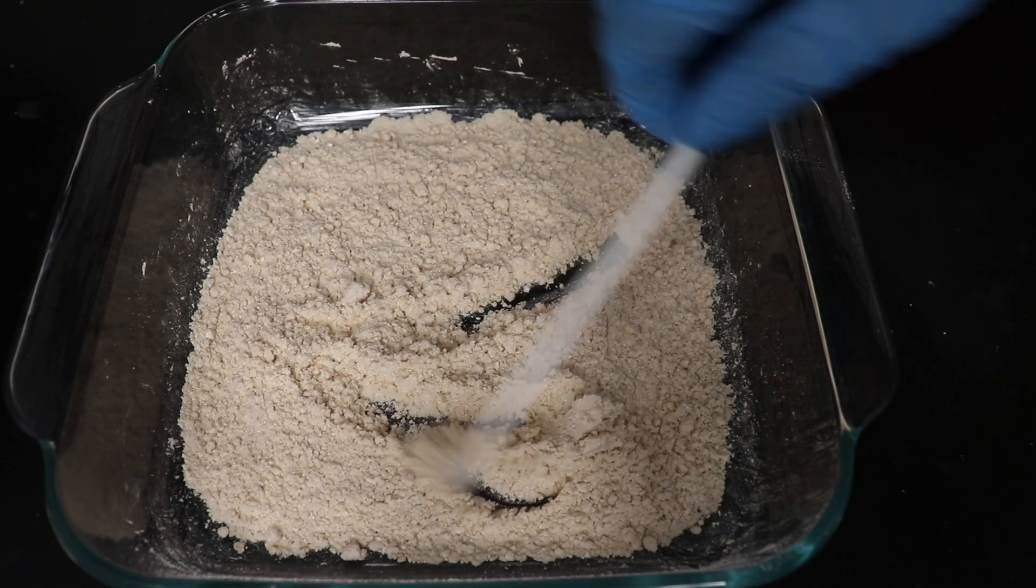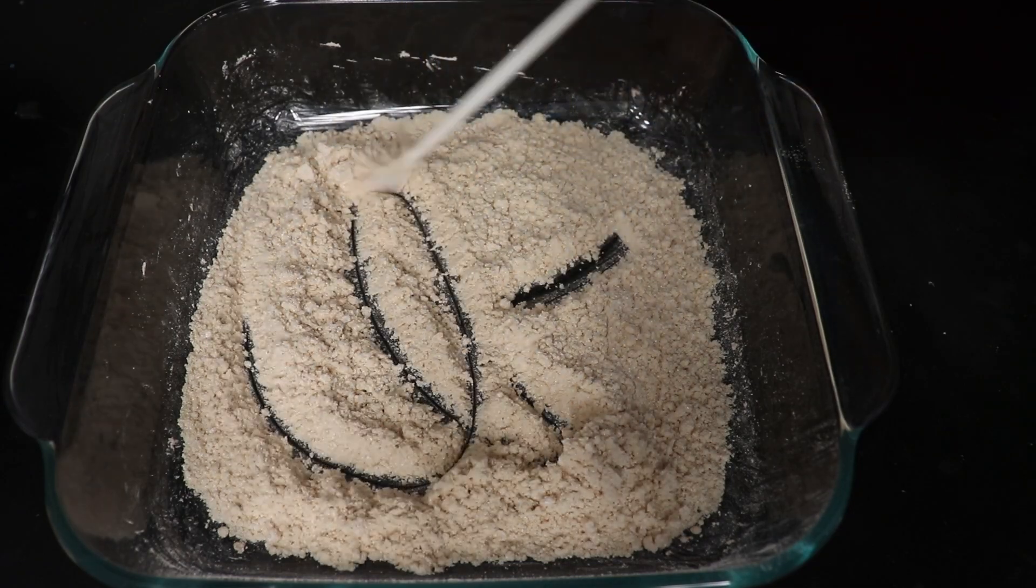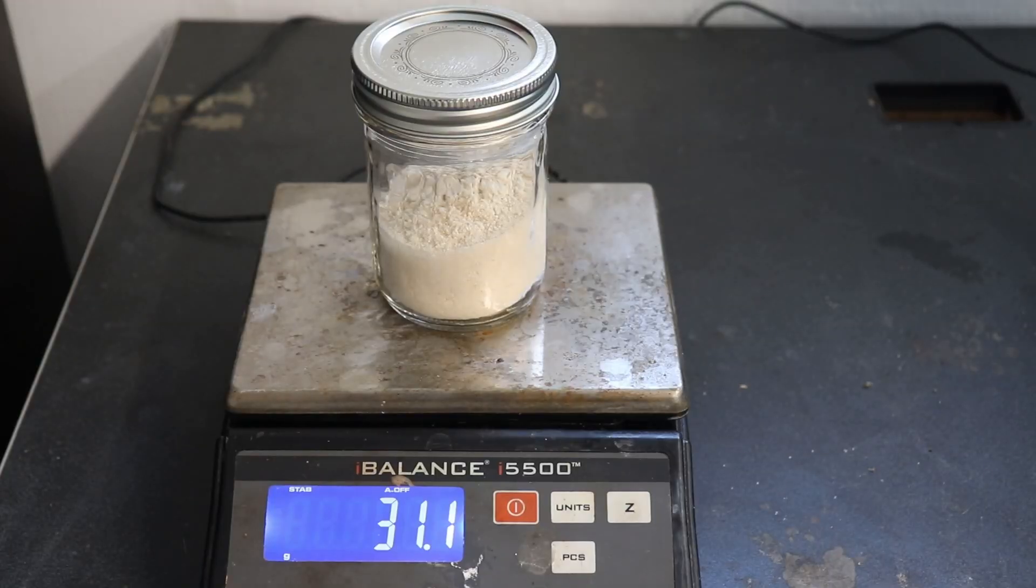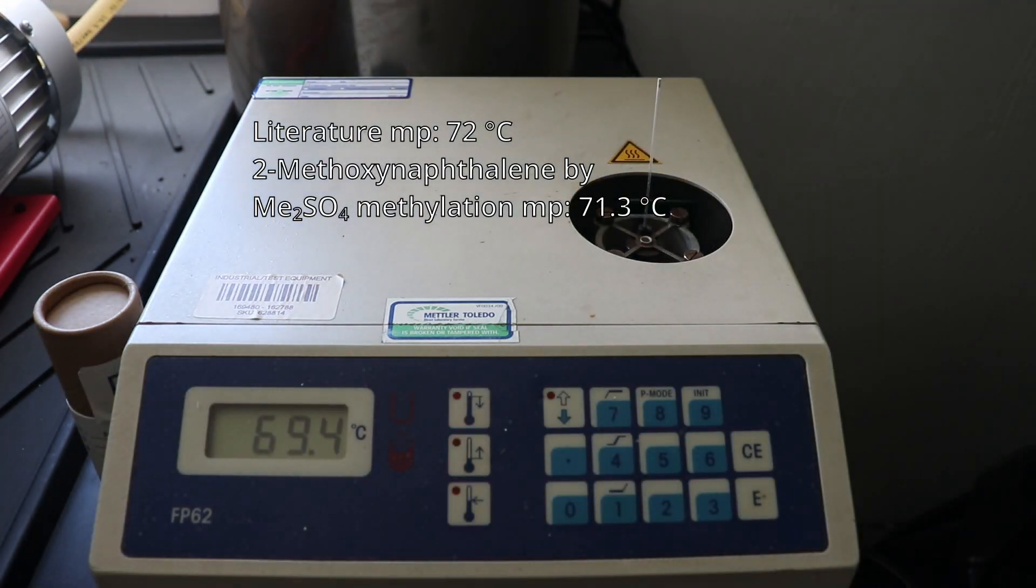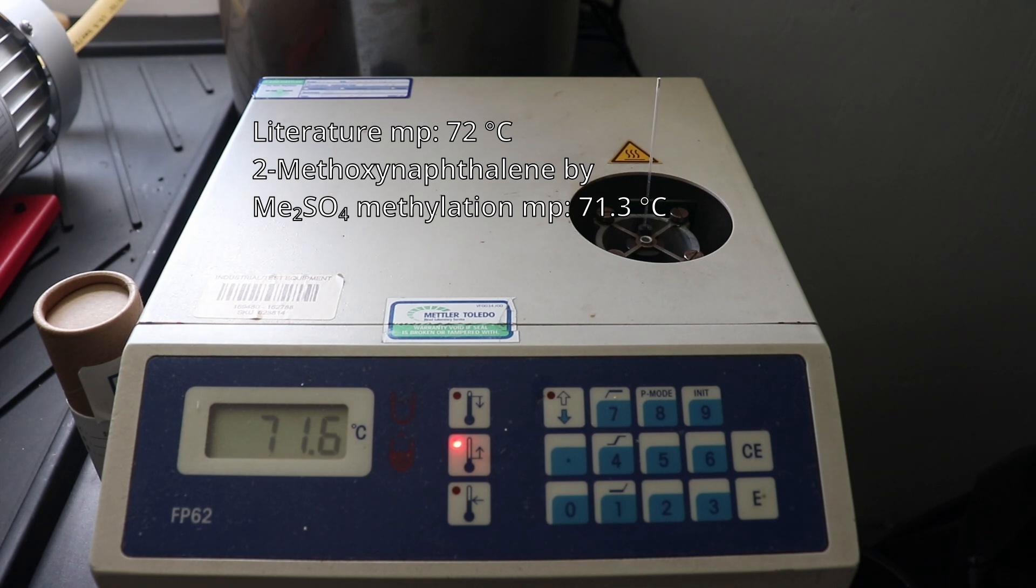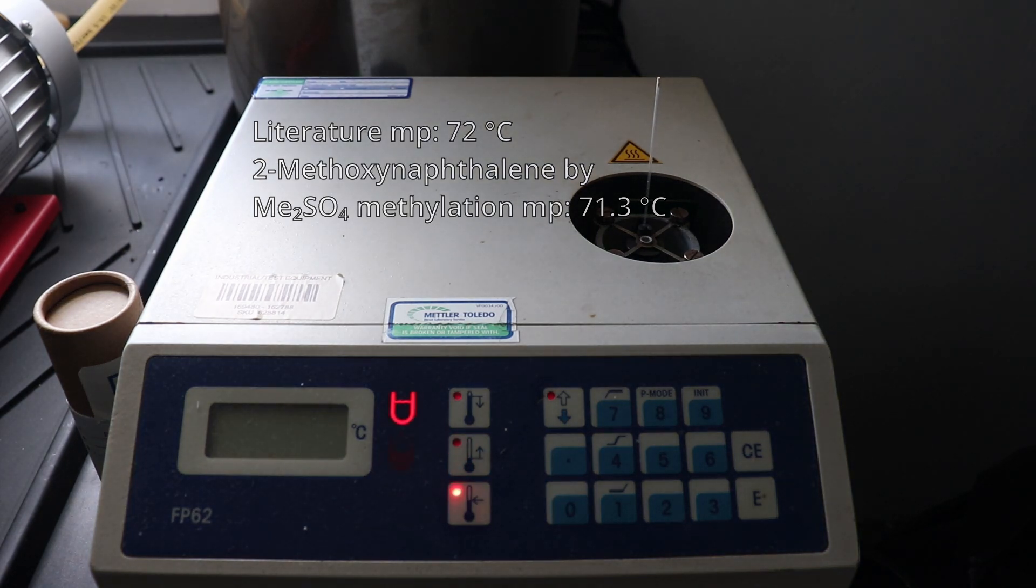The yield of the now dry 2-methoxynaphthalene was 31.1 grams, corresponding to a 79% yield, which is quite good compared to Vogel's 84% yield. The theoretical melting point of 2-methoxynaphthalene according to the procedure in Vogel is 72 degrees Celsius. The melting point of the 2-methoxynaphthalene that I just made was 71.3 degrees Celsius at a rate of 0.3 degrees Celsius per minute, which is a good result and allows us to say that we have successfully made 2-methoxynaphthalene.